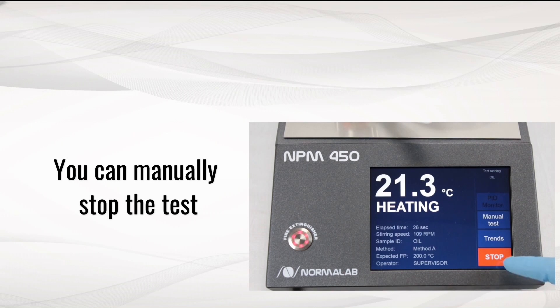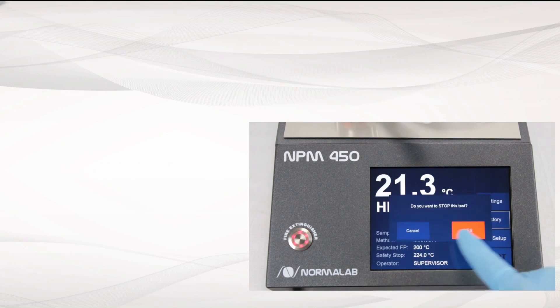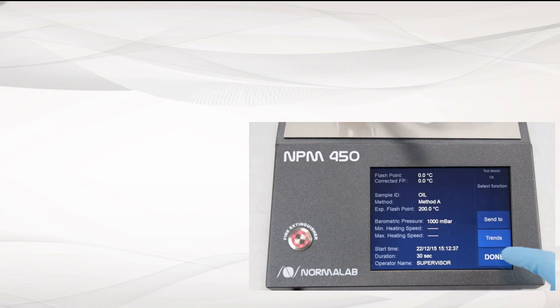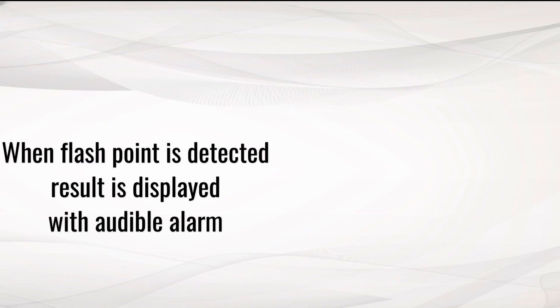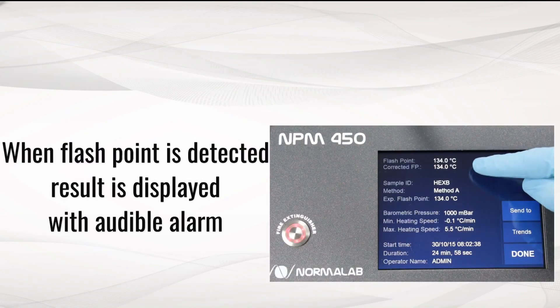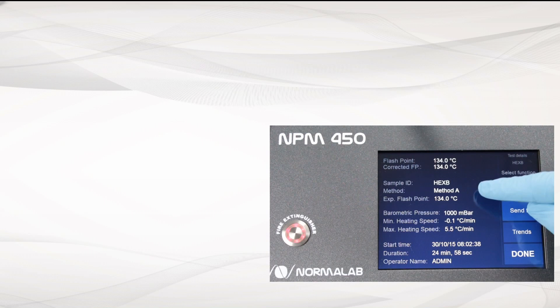You can manually stop the test by pushing the stop software button and validating your choice. When the sample flash point is detected, the result is displayed with an audible alarm.